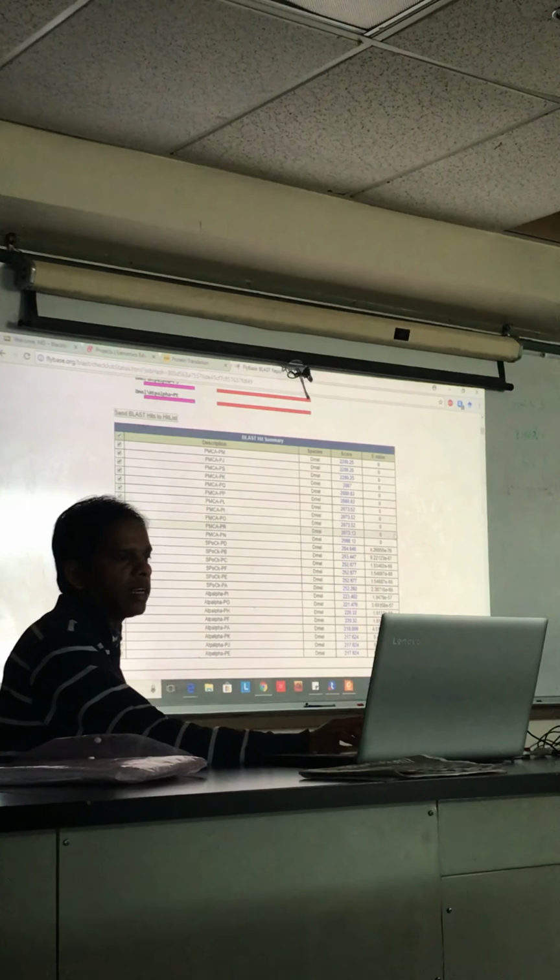Mr. Umar, could you assist me? Something's going wrong. It's showing the gene ID, but it's not the gene scan ID. This is different now from what I originally had. It's coming out with Contig 11.1, but the base pair look was different from mine.